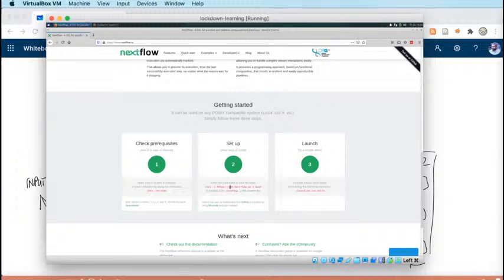There's nothing to stop this particular website here being hijacked by somebody malicious and injecting some malicious code into your machine via this. So I'm not a huge fan of this kind of mode of installation. But you can, by all means, copy this line and paste it into the command line, and that will install Nextflow on your system.